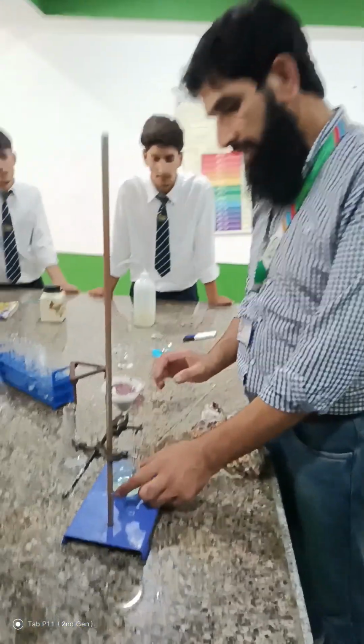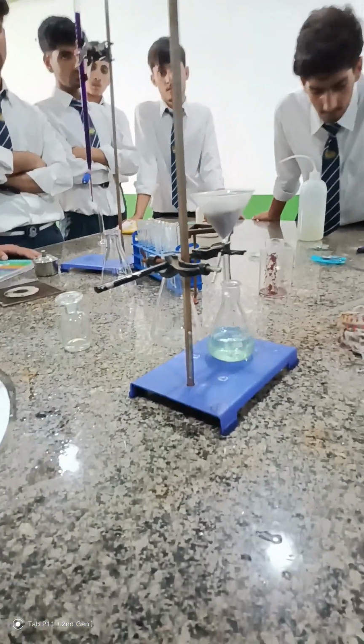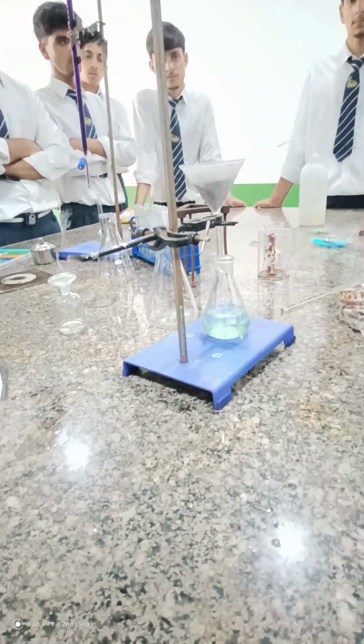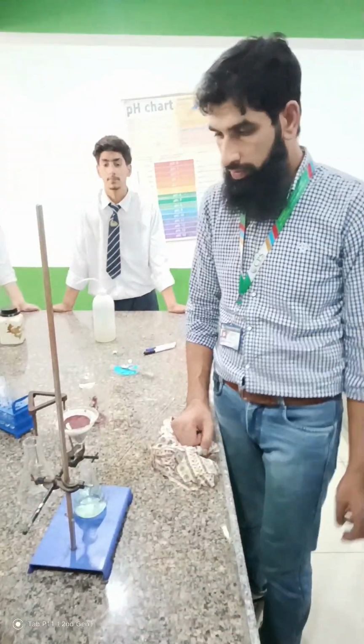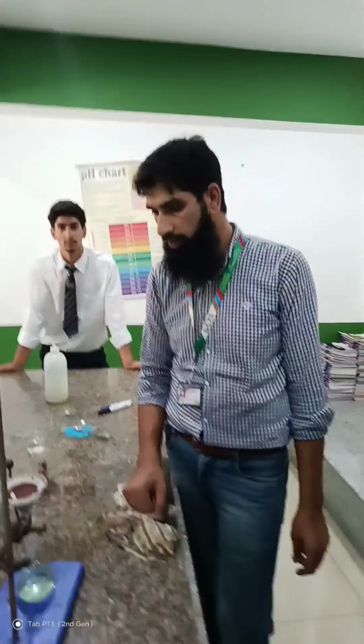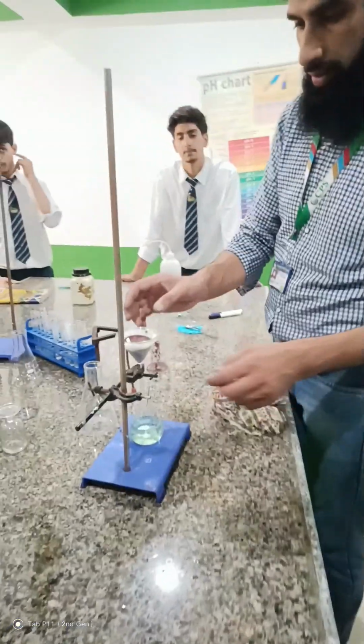But this filtrate contains our iron sulphate solution. It is crystal clear. Initially, we had taken a blue color solution. It is FeSO4, a light colored solution, and this CuSO4 is a blue colored solution, which is also called blue vitriol. Okay, remember that.